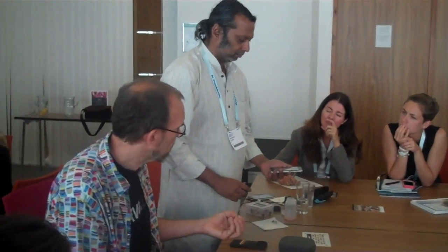So we use something called white balancing. Now it's done that. We take a strip test. It changes the color of this thing, and then it uses the calibrated application to do an interpretation of that. It finds all the dots, finds the black area, finds the strip, and it knows it's a pH test of one particular type, with only one dot that it needs to look for. And when it's done, it gives you the result, which is how much?